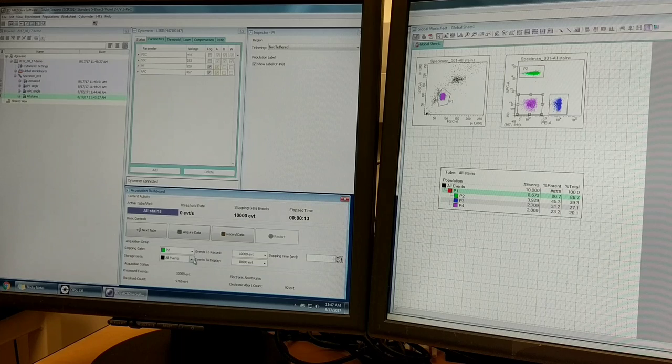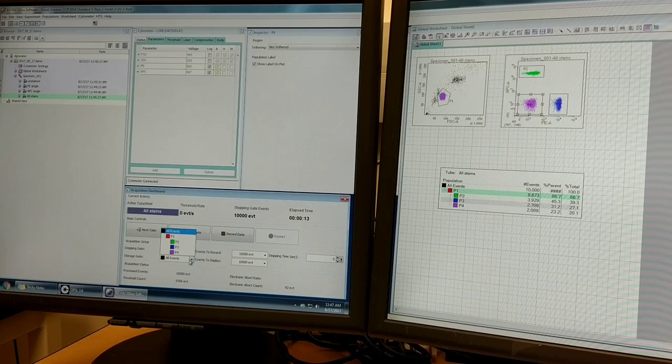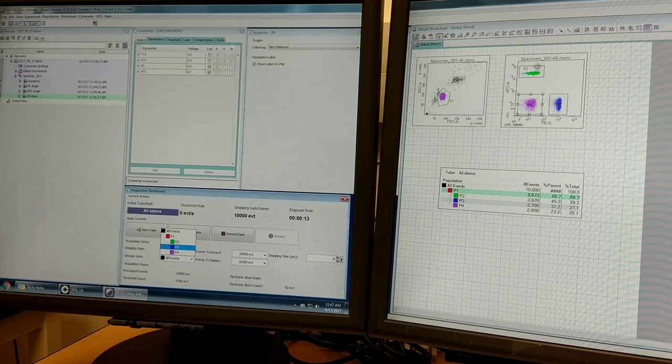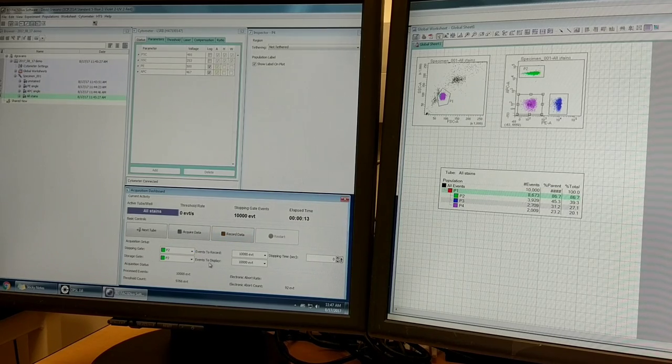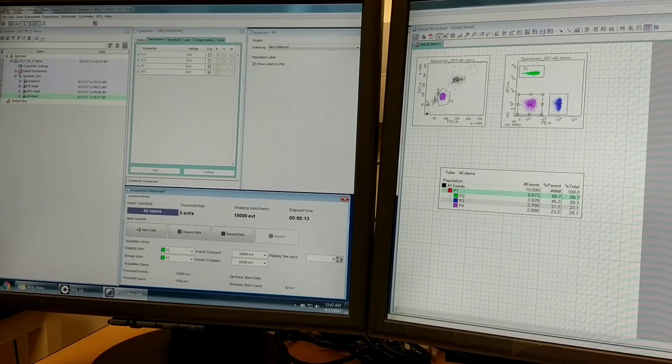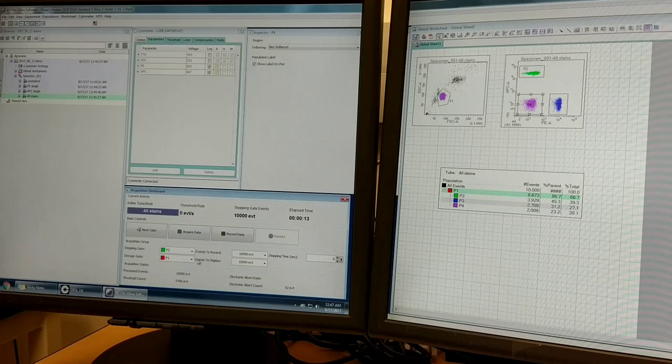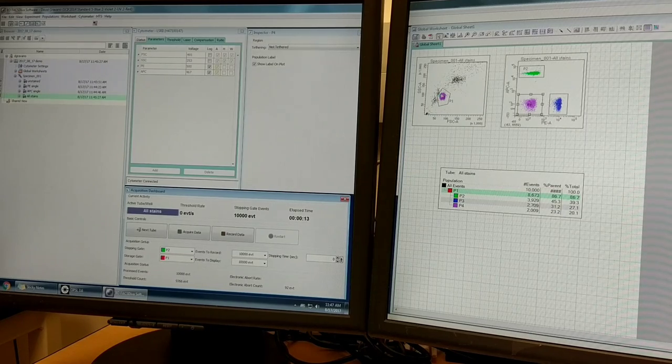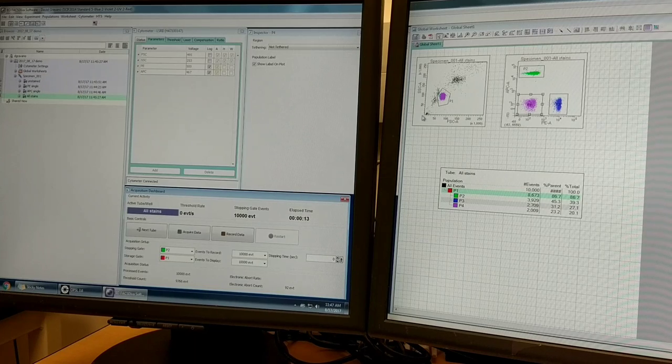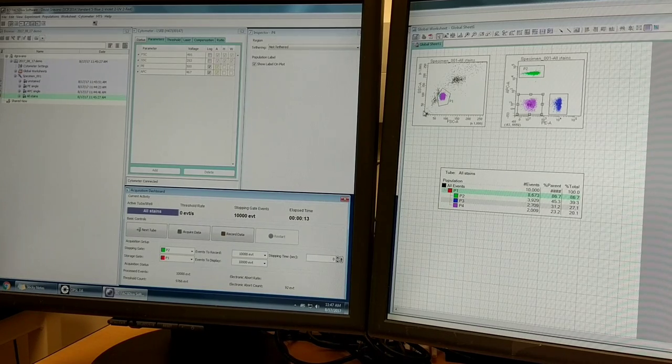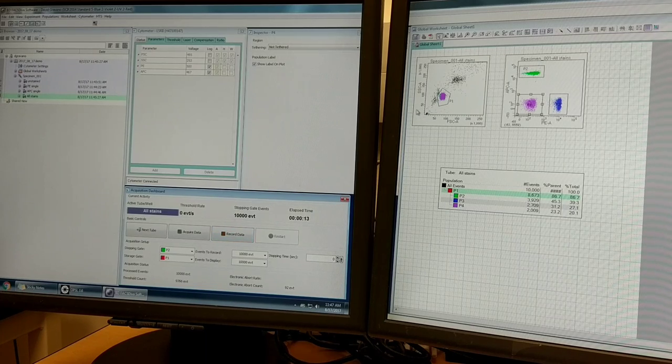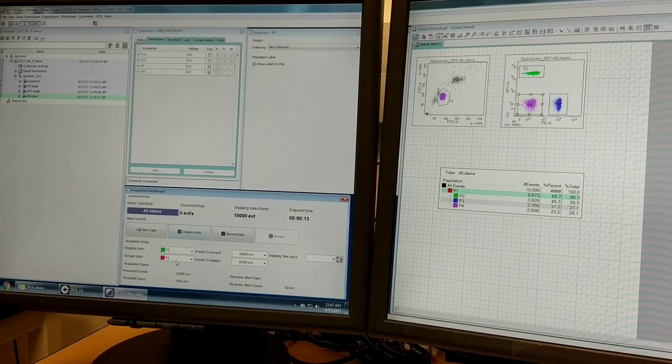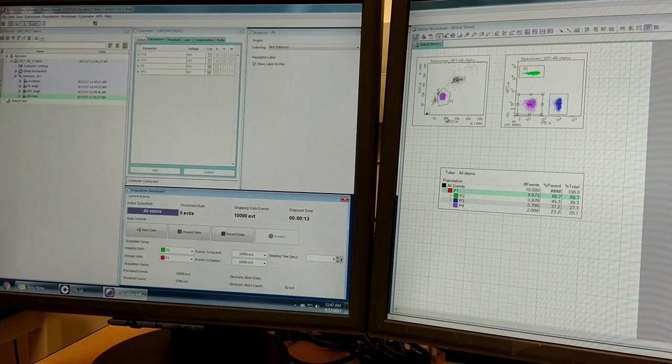There's another option called storage gate. You can only choose to store the data of the events that fall within P2, for example. I don't recommend doing this unless you have a good reason to do it. For example, if you've got a lot of debris in your sample you want to eliminate, you might select P1 to only store the things that are within this gate. So you don't overload your file with useless data that may be down here, the debris or red blood cells. Because you can't get that data back after the fact. If you store only P1, you'll never be able to look at any events that were outside of that P1 gate.